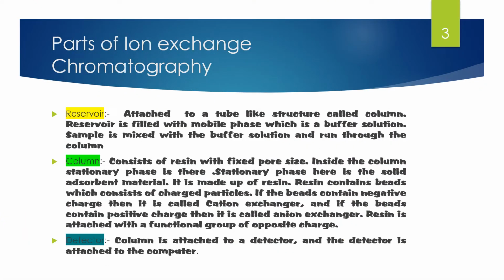So the parts of the ion exchange chromatography are reservoir, column and detector. This is the column containing the resin. This is the reservoir, as I mentioned earlier, containing the sample with the buffer.